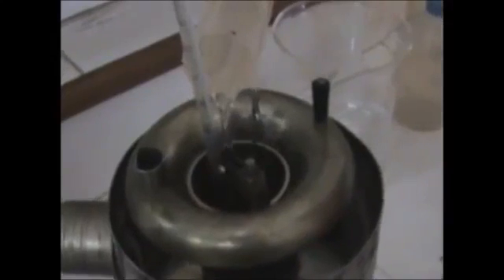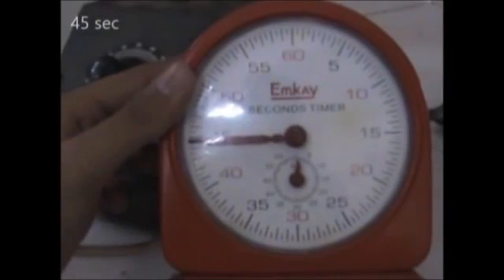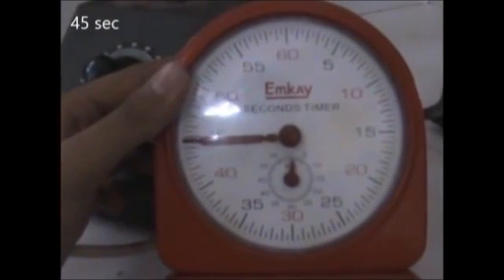Beginning with the experiment, we will be using glycerine here. Keep in mind that continuous stirring is required for uniform heat distribution, same as in the previous experiment. We start with heating the lubricant till 50 degrees. On reaching 50 degrees, we take out the stopper and measure the time for 50 ml to fill up. The first reading comes out to be around 45 seconds.